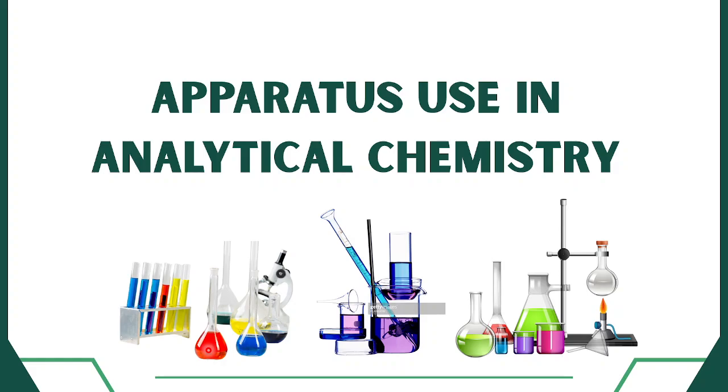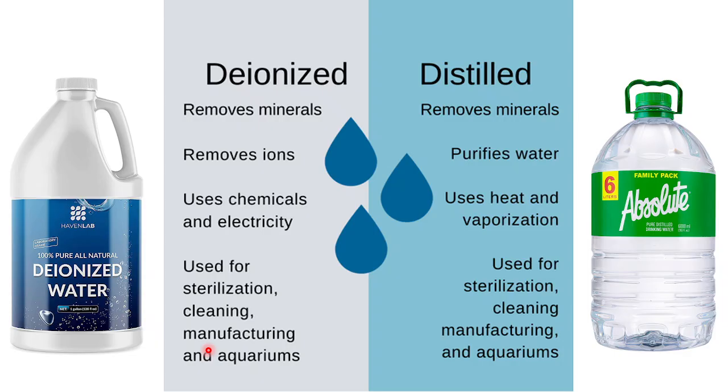Okay, so that ends our discussion for the different classifications of chemicals, the proper handling, and the proper labeling and marking or washing of our laboratory glasswares and other equipments or materials to be used in carrying out a particular laboratory experiment.